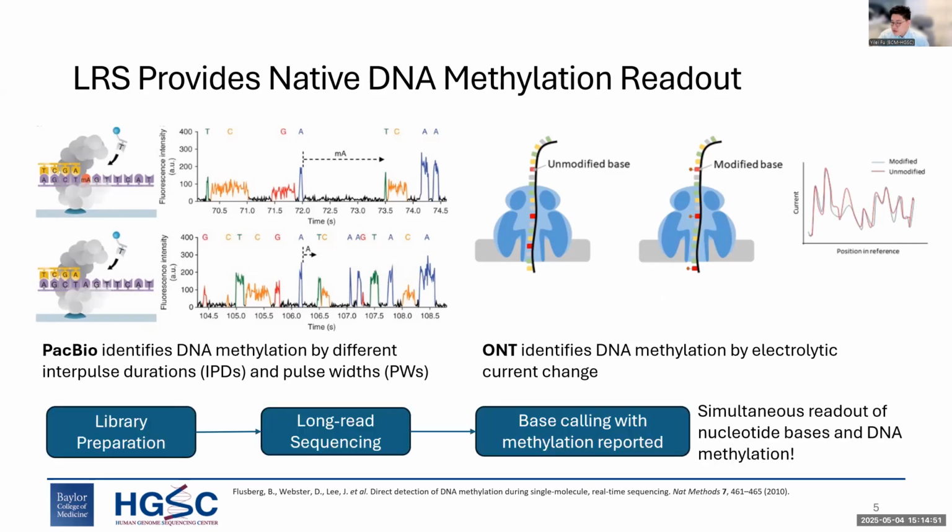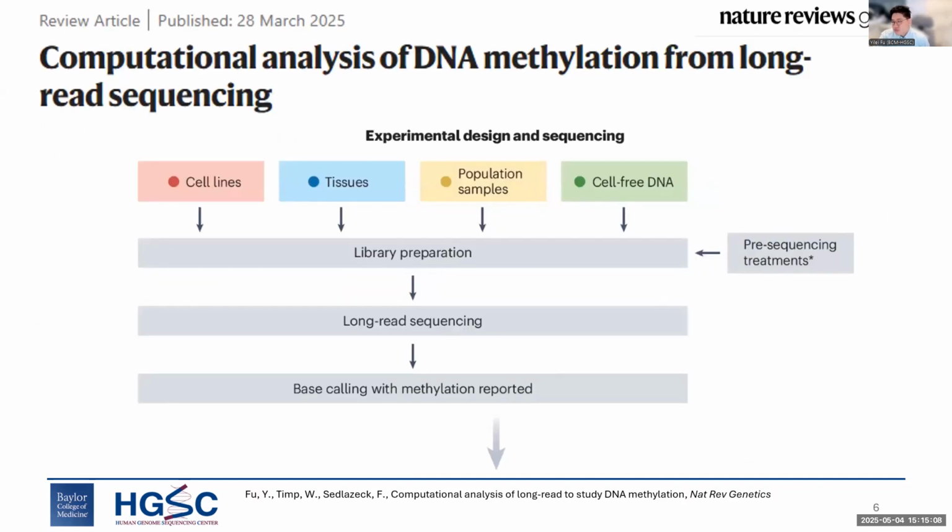With this direct detection ability, no additional steps are needed during the base calling stage, and we can access DNA methylation right after it. Again, only long-read sequencing here could provide the simultaneous readout of nucleotide bases and DNA methylation. With this knowledge, we further looked into how to perform DNA methylation analysis on long-read sequencing data.